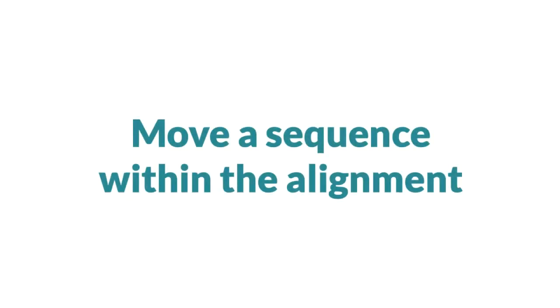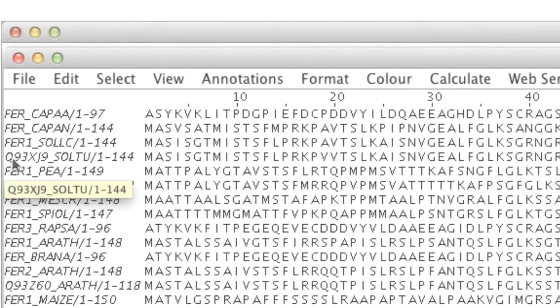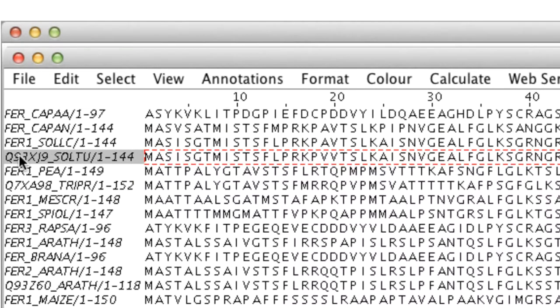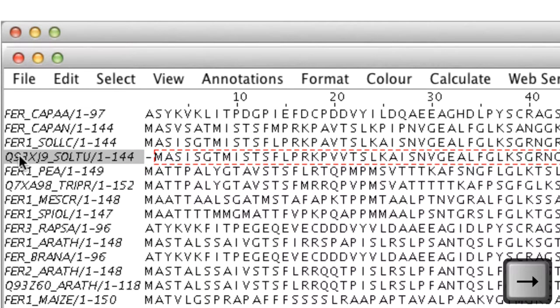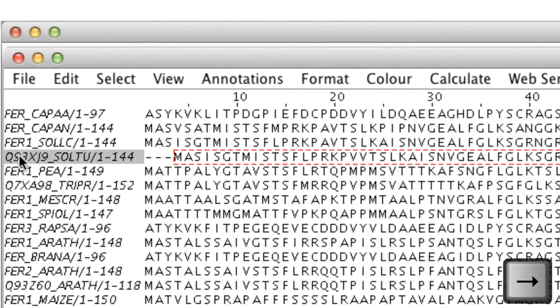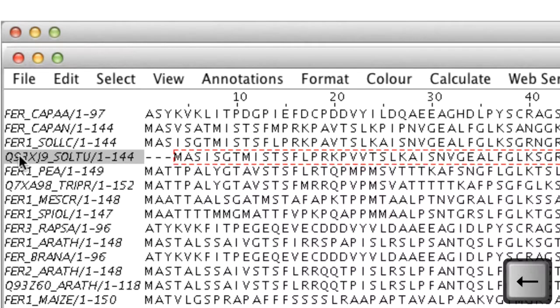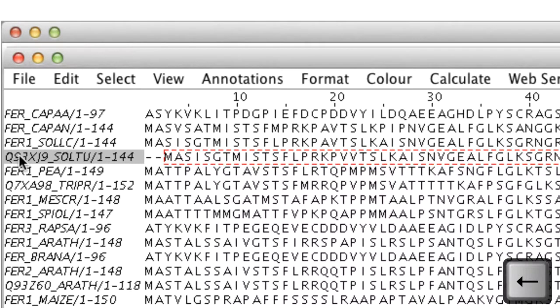Jalview's editing interface allows whole sequences to be moved within an alignment. First I select the sequence in the Sequence ID panel using the left mouse button. Then I press the right arrow key to move the residues to the right and the left arrow key will slide the sequence back.